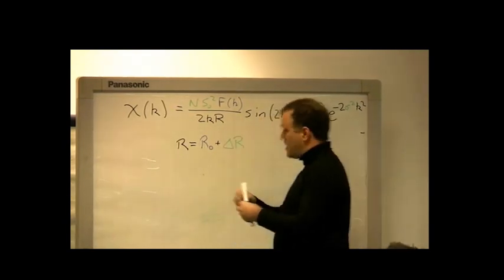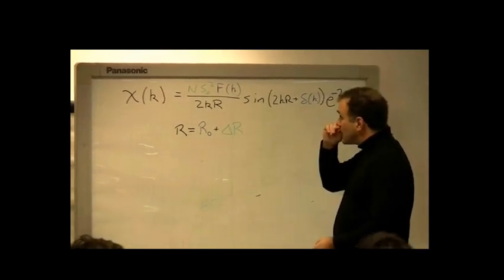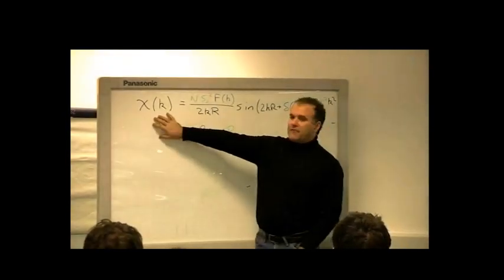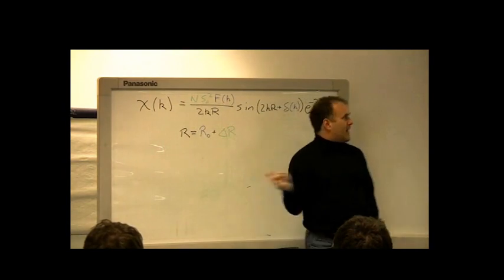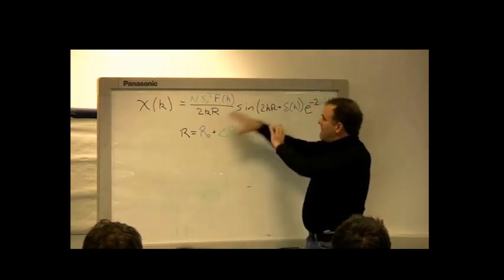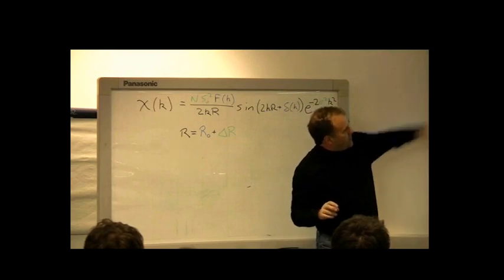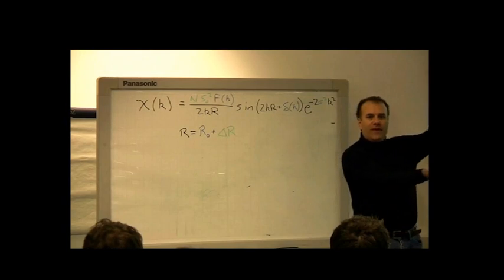So the way the fitting works is like this. This is the EXAFS equation. So the contribution from each path has to be evaluated. We somehow evaluate this equation for every path that's included in the fit, and then add up all the paths that are included in the fit, and compare that to the data.